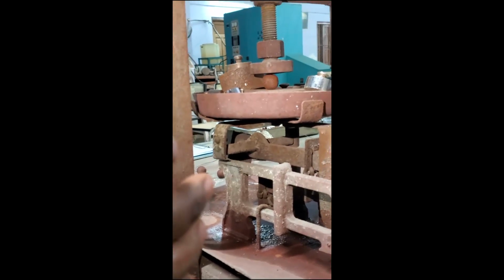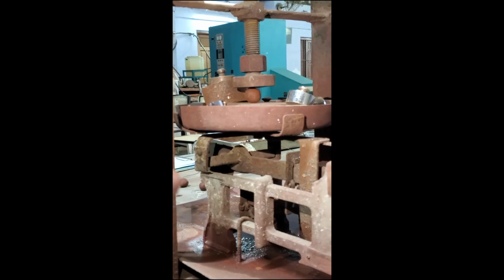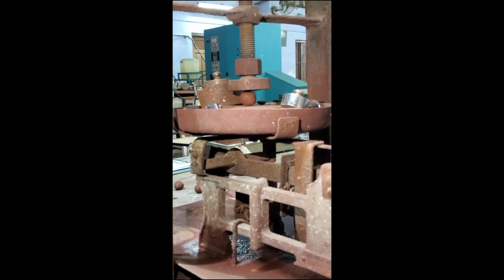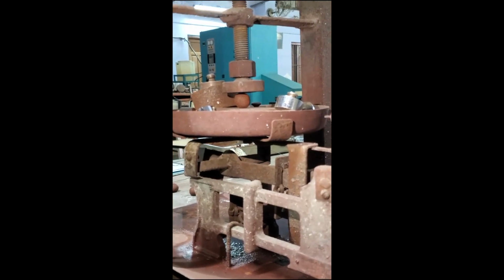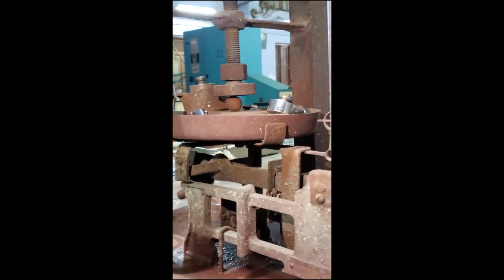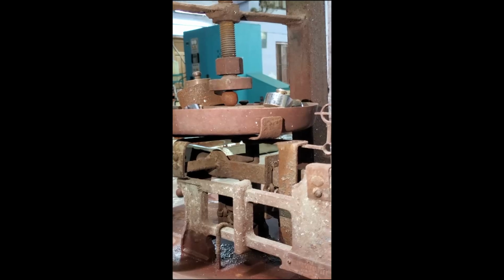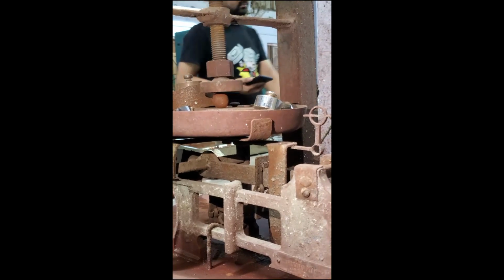So we are observing the pellet. When it cracks, at that time we have to see the reading also. So slowly we are applying the pressure on the pellet by filling with the water.